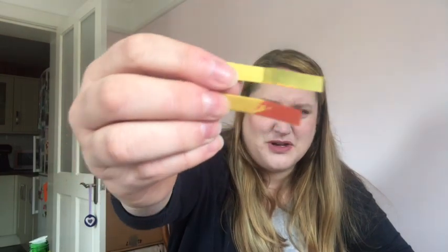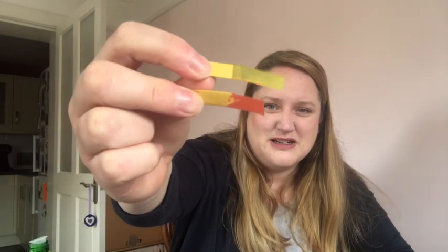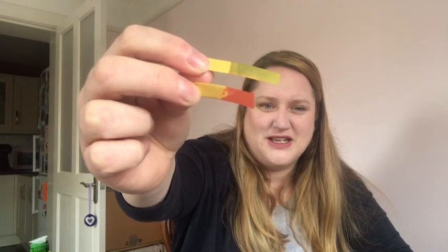If I take those two, I'm going to show you these again. These are our two testers to make sure the strip works. The pink one was the lemon juice and the green one was the tap water. So a nice pH 7 for the tap water and about 3 or 4 for the lemon juice. Okay, on to our soil samples.